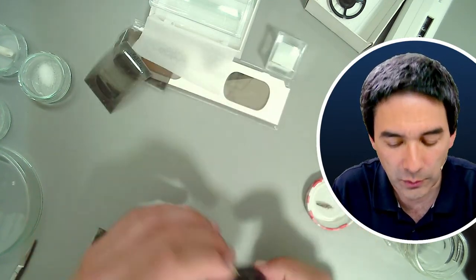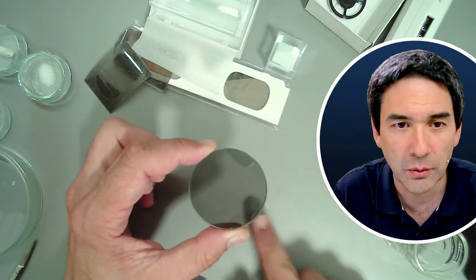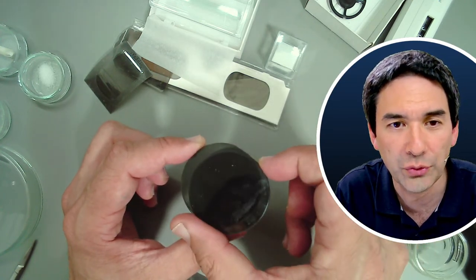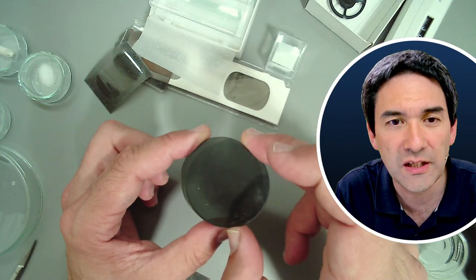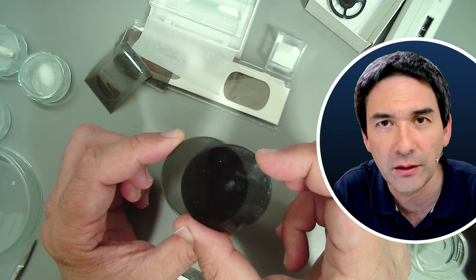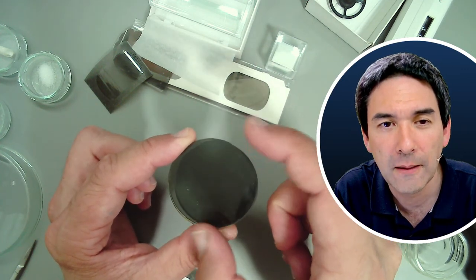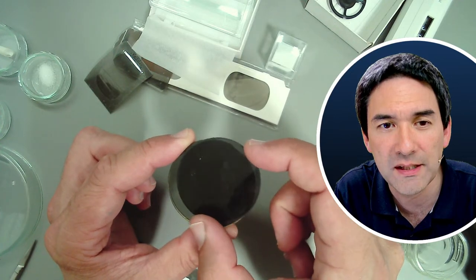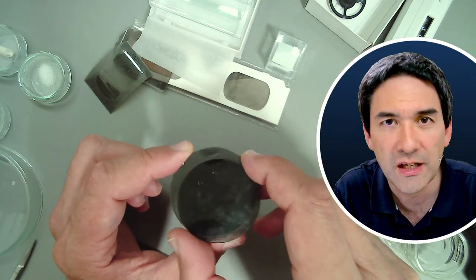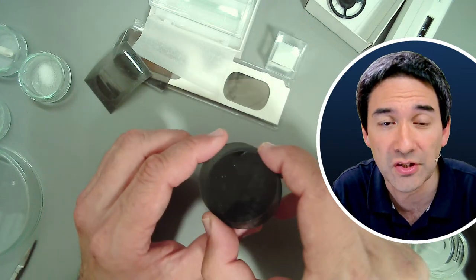What they do is the following. If you have a bright background, you're going to see here my finger, and if you put the other one on top of it and start to rotate it, you're going to see that in a certain position it's going to be completely black, like for example right now. If you rotate it again, then it's going to become transparent again. What happens is that when we place a sample between those two polarizing filters, then some of the samples will start to shine up and light up, and it looks quite nice.